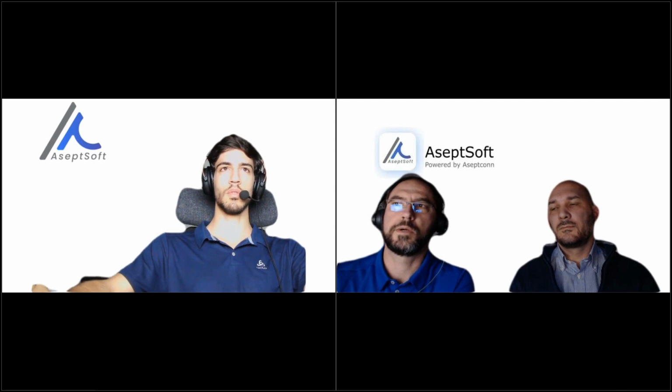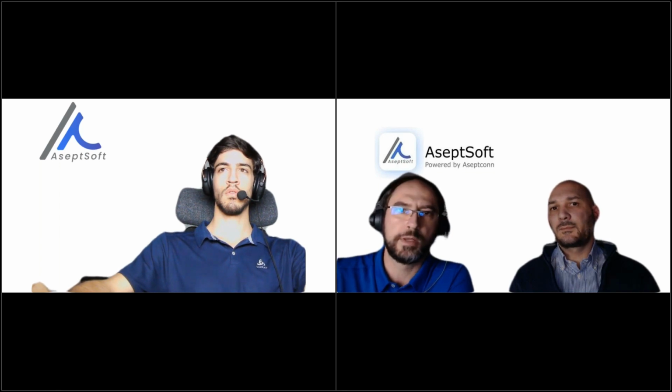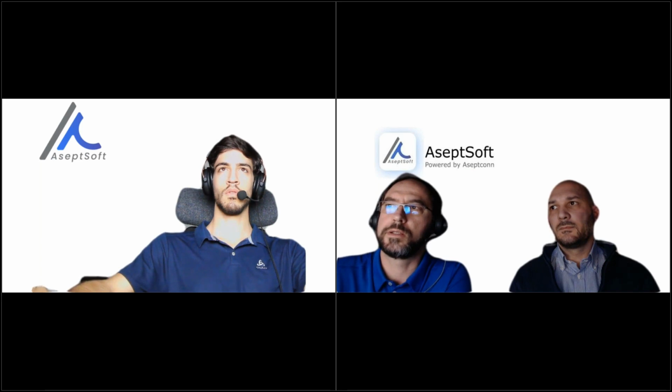Thank you very much. Next question: are you looking at future support and development on top of the current software? Yes, we are currently developing next versions of the software. We are increasing our support team and also our programmers team. So yes, we are increasing and developing.